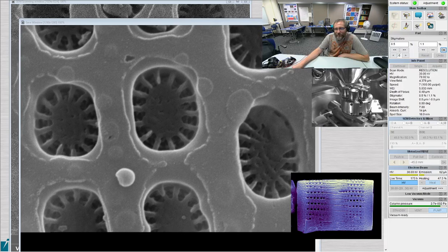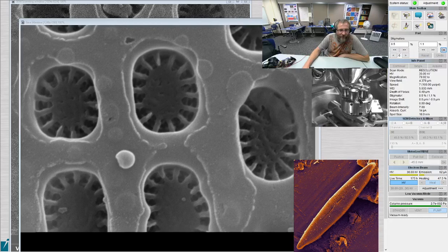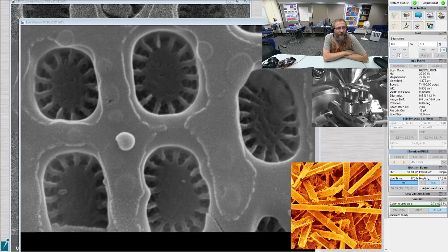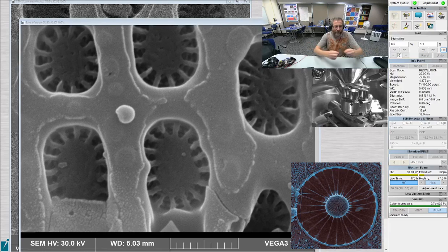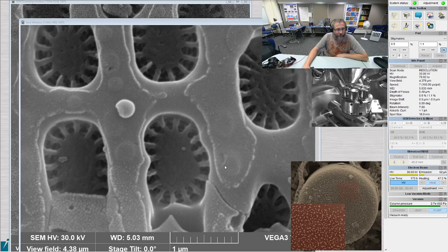Yeah, there are some secondary connections in the back that you can see, because the little pieces go down into the internal part, and I think there's probably a secondary spoke on the inside. But we saw the inside view of one of these at the beginning of the stream, where it looked like the inside had more of a platform on the backside, and the outside just had these spokes, but they were different. They didn't have a blob in the middle like these do. They were a little bit more like total wheels or spokes without the central bullseye. So, yeah, and also up against the spines here again.